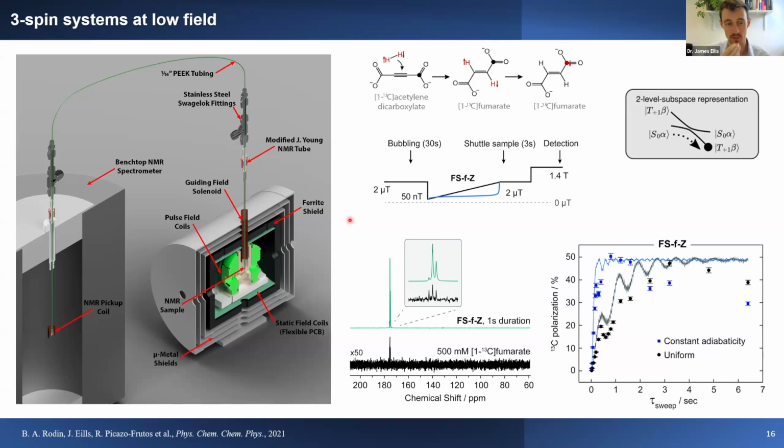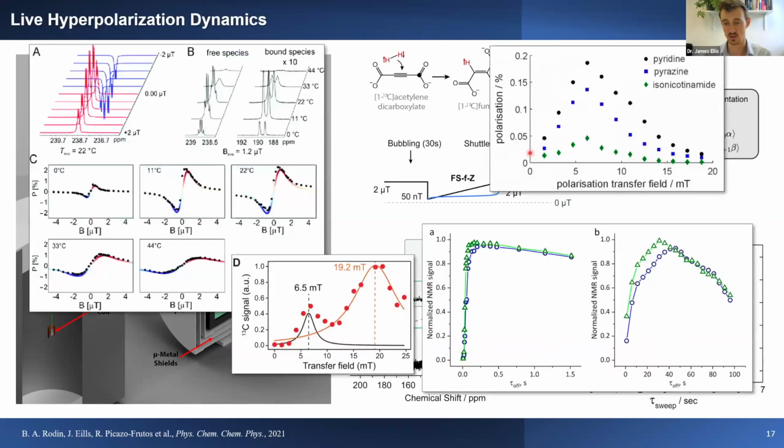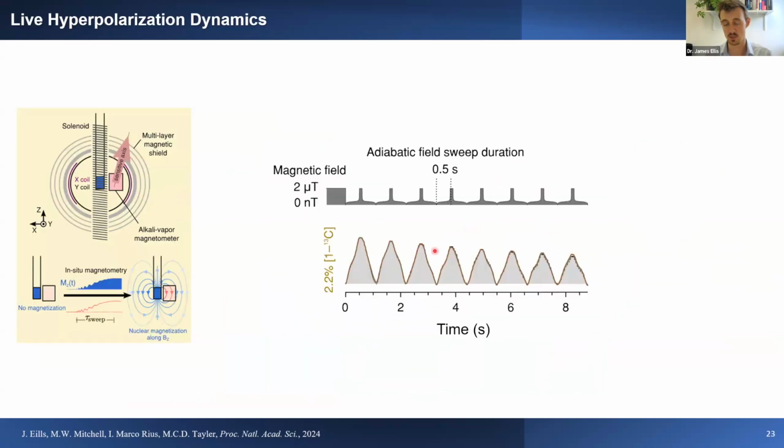And then possible direct applications that I see for the setup. Well, one obvious application that I guess everybody is aware of, probably the key application, is to produce hyperpolarized metabolites for in vivo imaging. But maybe there are some other applications in quantum information science, especially based on some of this work where we have good control over a 3-spin quantum system that has a very long lifetime of many seconds. So maybe there are some sorts of applications there for quantum information science.